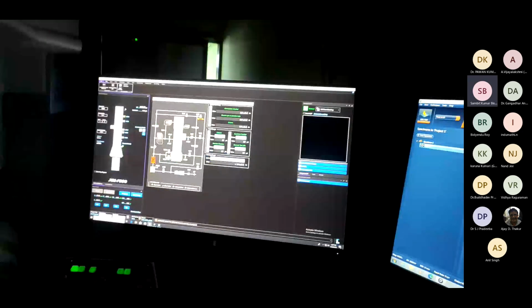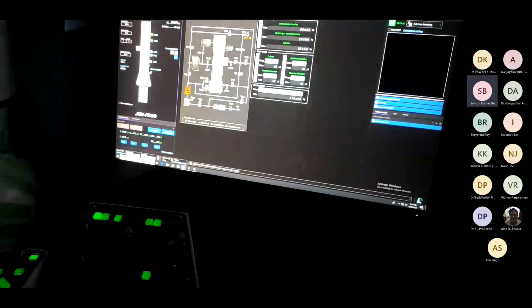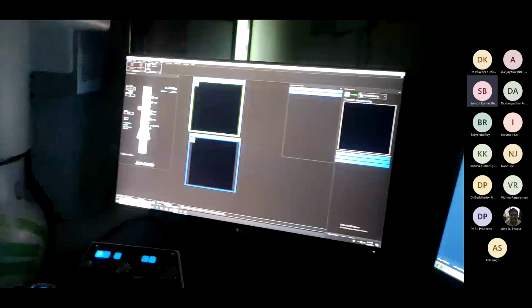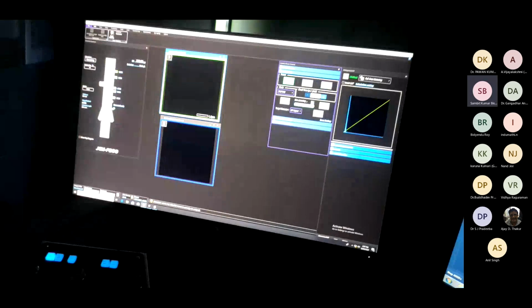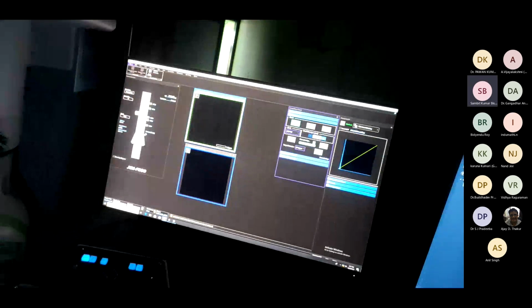Now I'm going to operation, and from TEM operation to scanning operation. The operation is changed, TEM to scanning, so the aperture is to be removed. Now I have to go to scan. I have to select the spot.